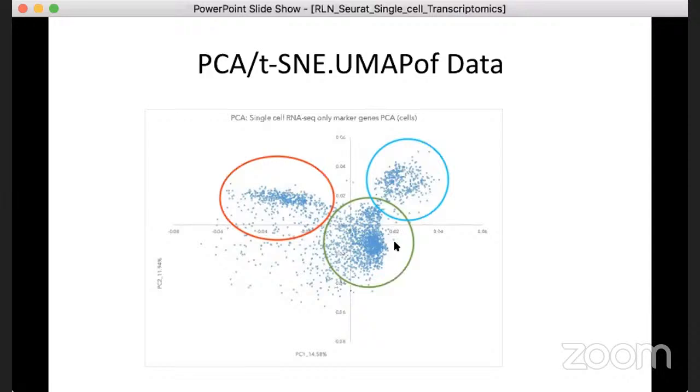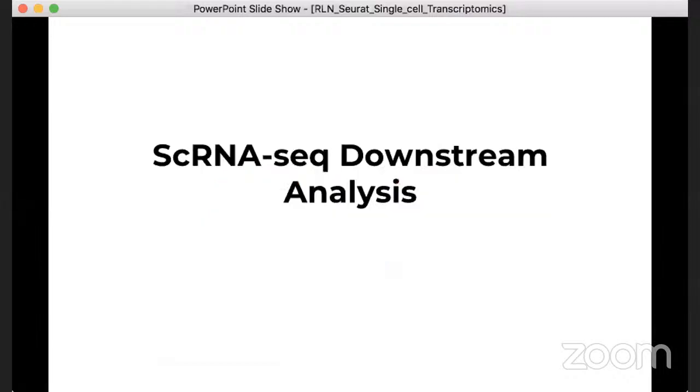So this is a very broad overview of how downstream analysis can be helpful in understanding the cell types. Let's go over these steps one by one in detail, and see what analysis processes we can subject our count matrix to and what we can learn from them.